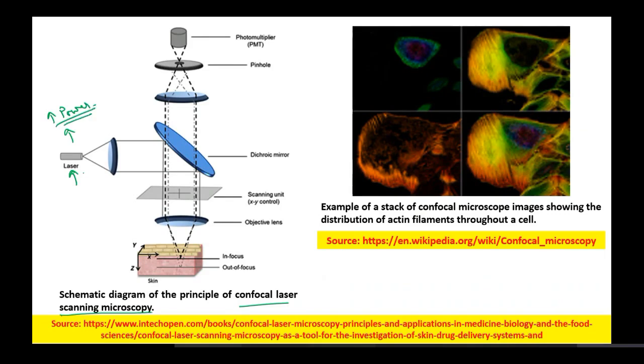Now if you see all the things, it is similar to your fluorescence microscope. There is a filter over here which will allow you to filter out or select a monochromatic light. Even we can use the laser source, which has a very narrow band.